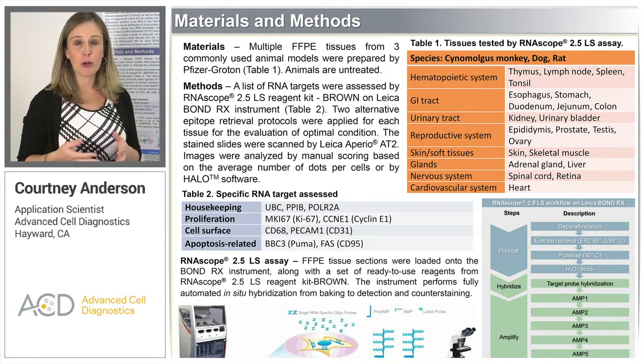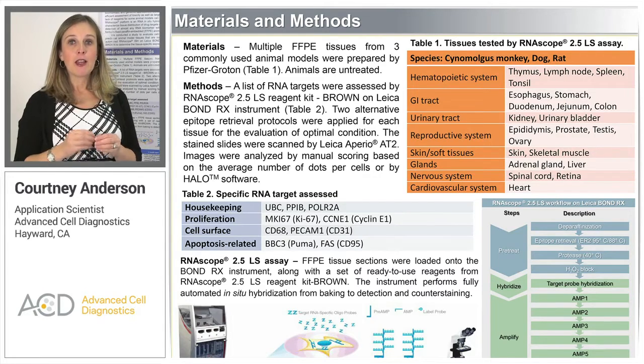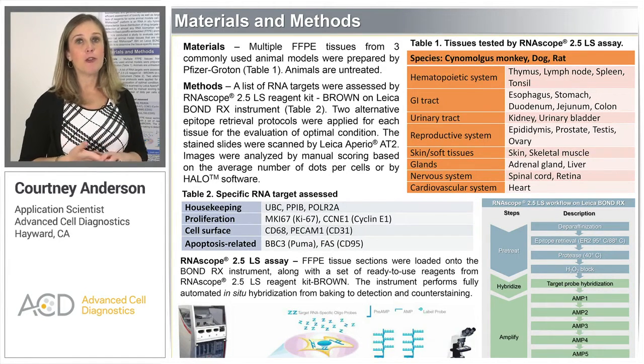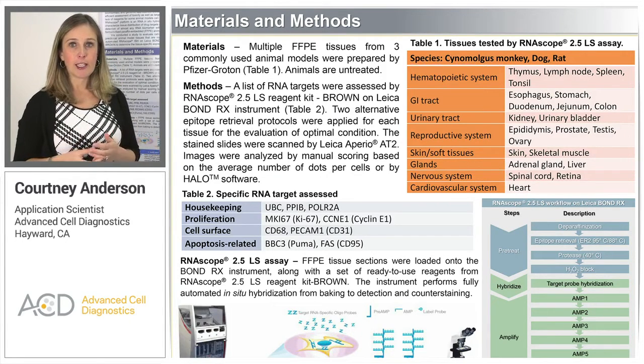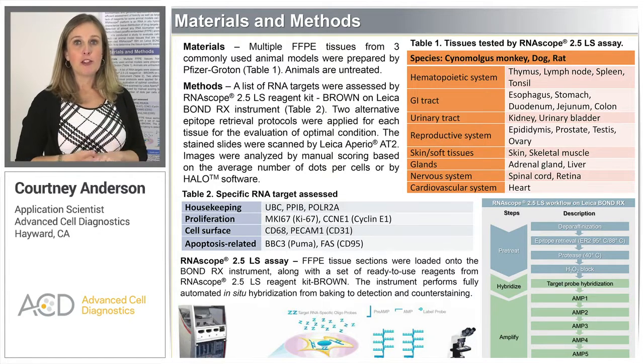Okay. Now I'd like to point out that we prepared our tissue according to the Pfizer-Groton protocol, which is a specific protocol in which they cut tissues into 3 millimeter sections and then fix these tissues for 24 hours to 48 hours in 10% neutral buffered formalin. So all the recommendations that we provide in the study follow this protocol. If a different protocol is followed, then optimization may be required for your tissue.